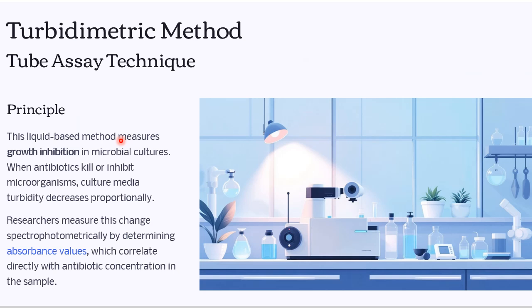If the antibiotic kills or inhibits the growth of the microorganism, the turbidity of the culture media reduces, and this is observed spectrophotometrically by measuring the absorbance of light.